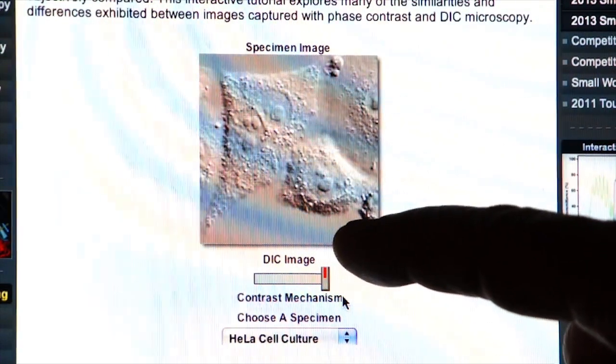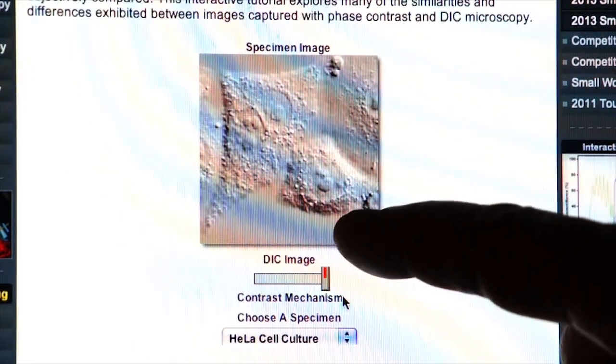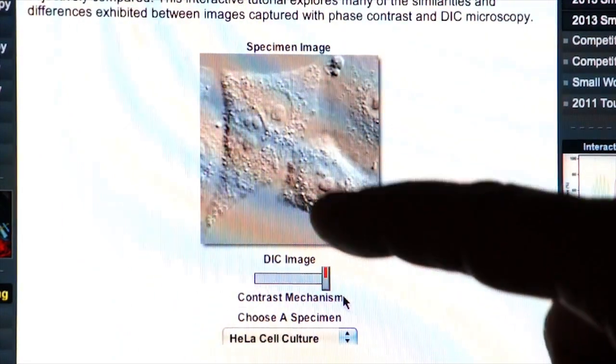The preferred methods of transmitted light illumination and viewing are DIC and bright field. Before ending this session, I want to show you the difference between DIC — differential interference contrast — and bright field microscopy using the computer screen. Both are transmitted light illumination methods, and sometimes DIC can be more useful than bright field depending on the specimen.